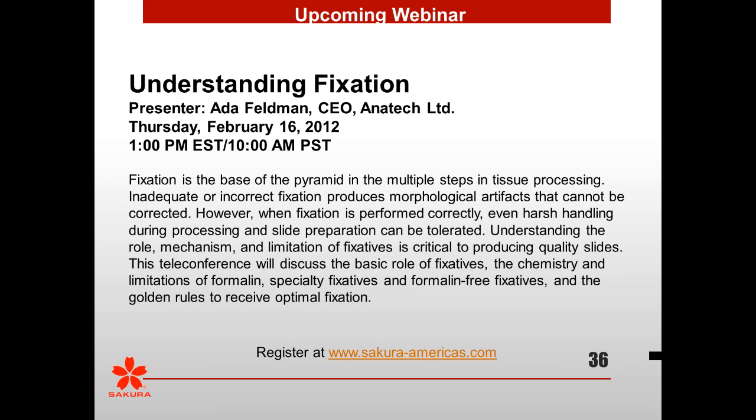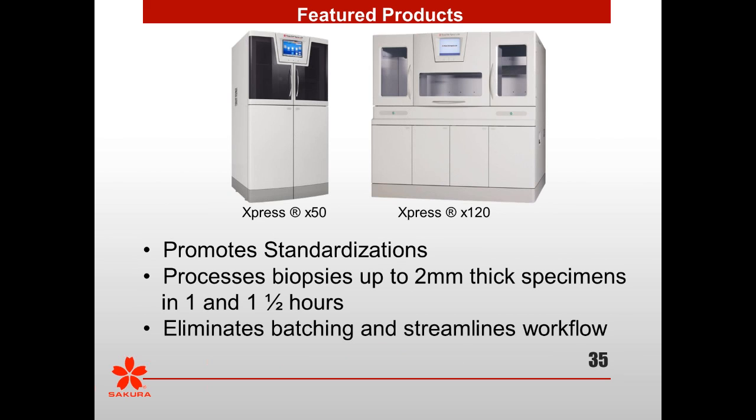Well, I guess what you're saying is that none of their PAs are willing to use the tools. It depends on what kind of management authority you have over the process. If the PAs are managed by your pathologist, as with any change process, you're going to have to get buy-in from the pathologist. If they are your own employees, then you have to demand compliance, and there are a variety of ways that you can demand that compliance. Before you get into the demand part, I would suggest that you sit down and discuss why you need to do this and what your outcomes can be. And again, most often this is going to take participation by pathologists.